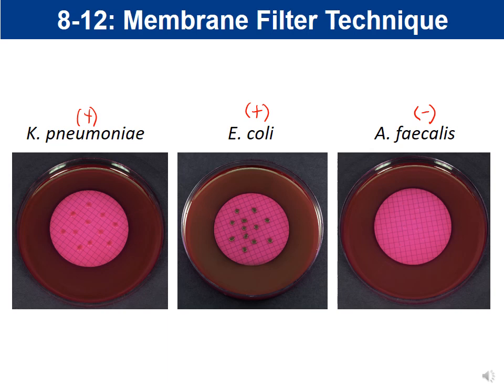Now that we've talked about the readout, I want to go back and address why we are using a nutrient agar. In fact, there's a question in your question set, under the MacConkey agar part. If you're looking at your question sets, turn to question 137. Question 137 says, explain what the results on the nutrient agar control plate prove in this experiment.